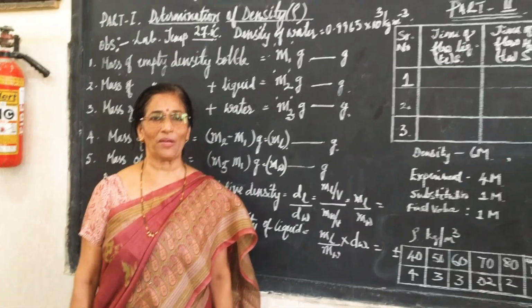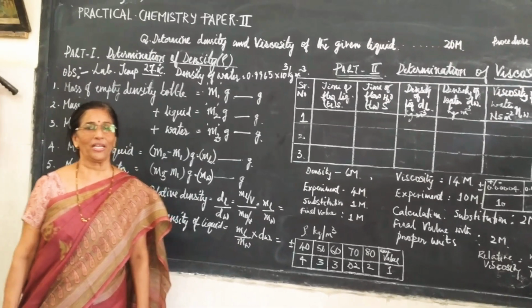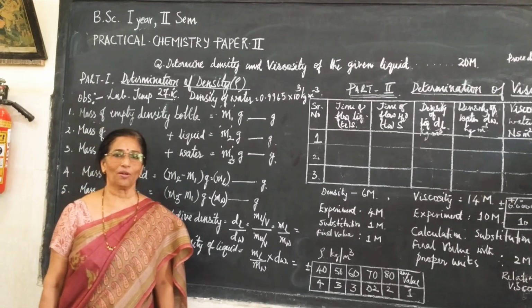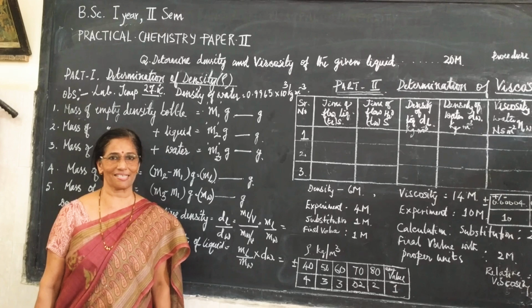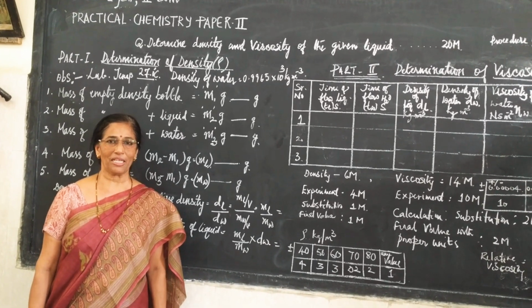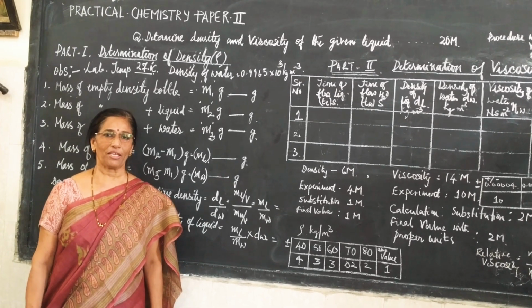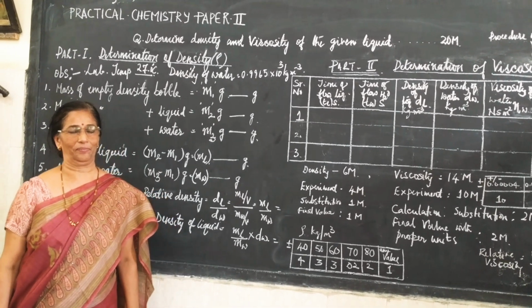Hello students, welcome to my video lecture. Today I am going to give a video lecture on chemistry practicals, paper 2. My topic is determination of density and viscosity of a given organic liquid.